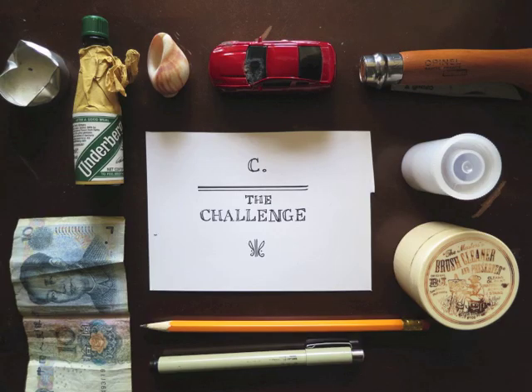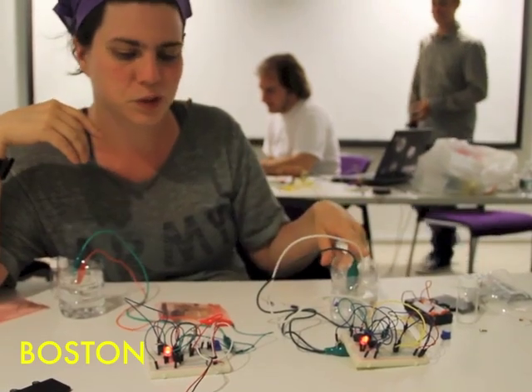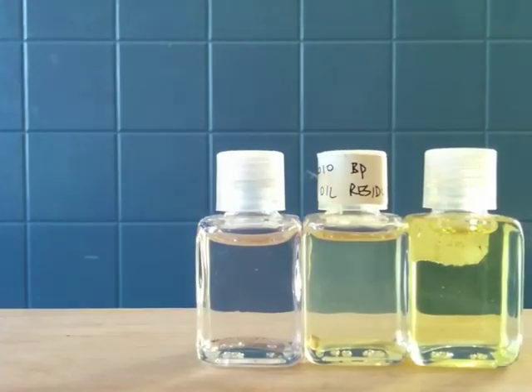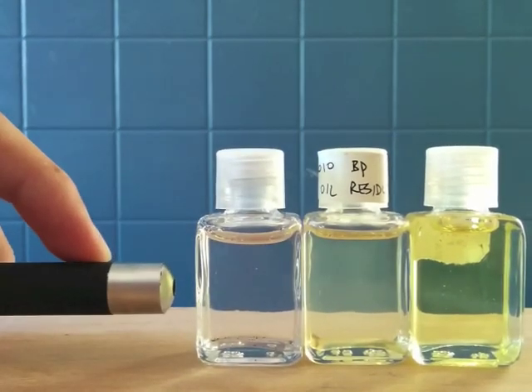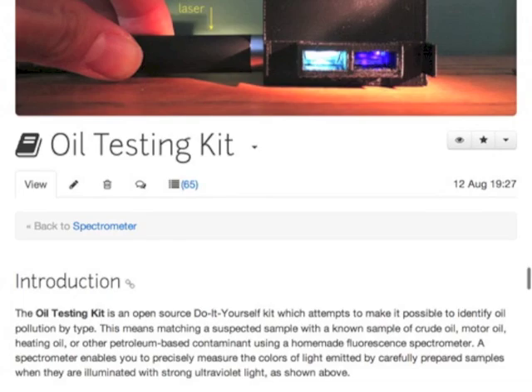Today, we're inviting you to pitch in and help take the oil testing kit to the next level. The Public Lab community really works together like this, and so could you if you joined. We're designing the kit to be affordable, easy to use, yet precise. And of course, open source so you can download the plans and build one yourself today.